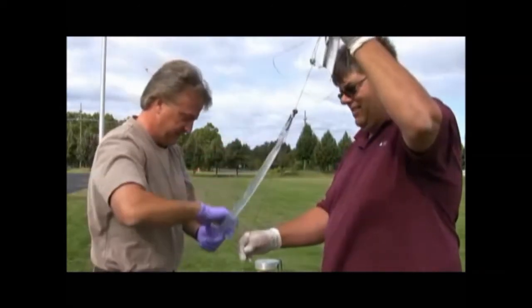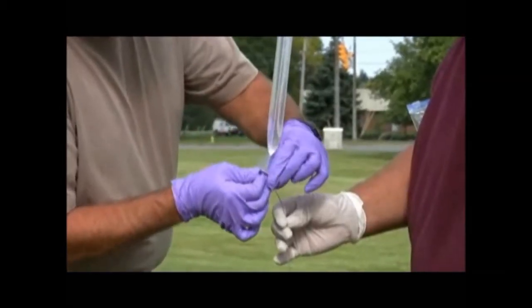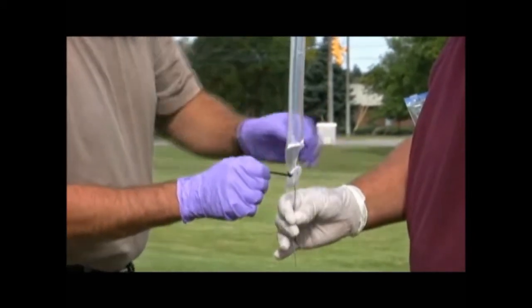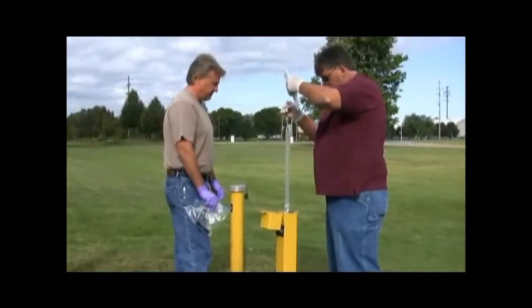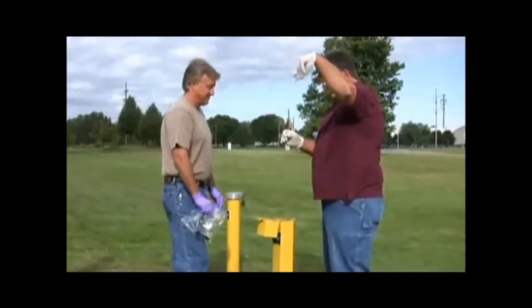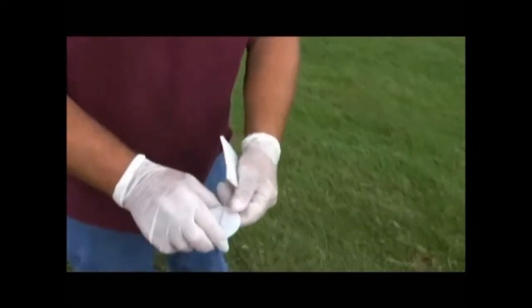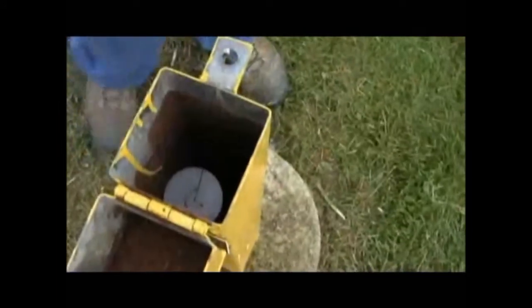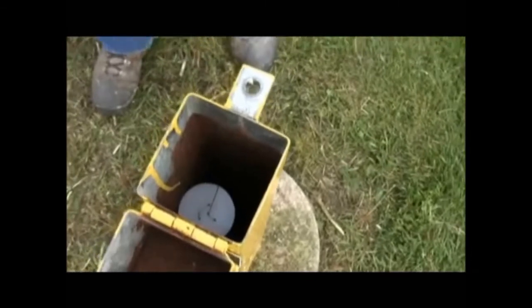First, connect the bag to the top clip of the line, then secure at the bottom using a zip tie. Lower the bag into the well. The stop cap will stop the bag at the desired depth. The PDB is now deployed.